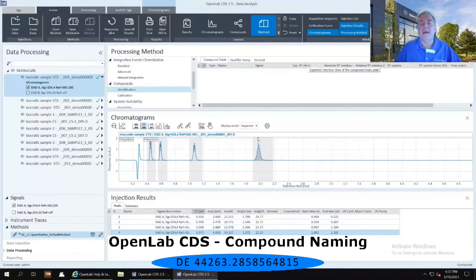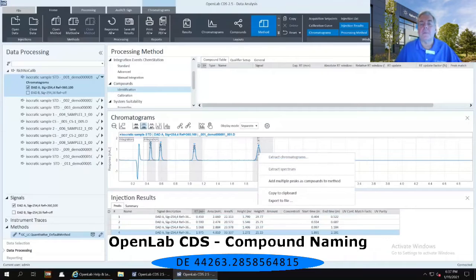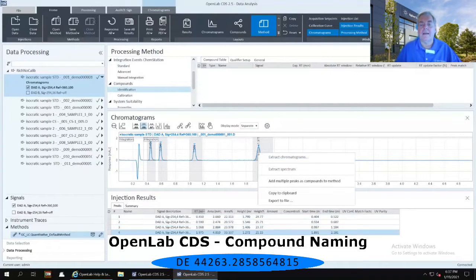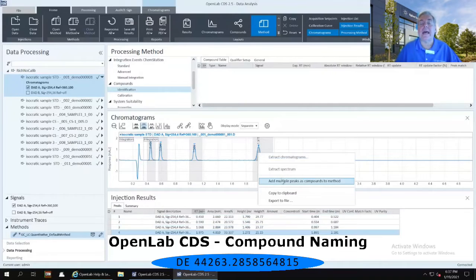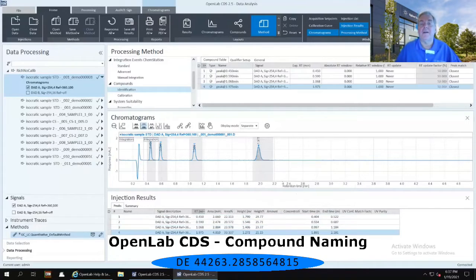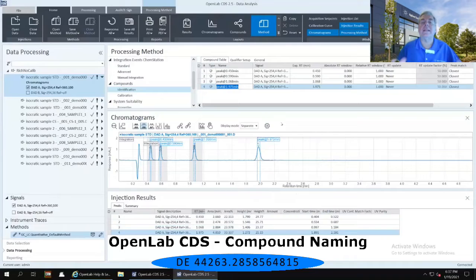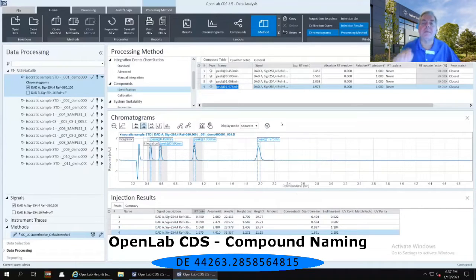Then I'm going to right-mouse click inside that chromatogram again and select to add multiple peaks as compounds to the method. That's going to add for me those four named peaks and put it in my compound table.